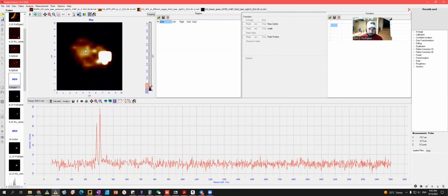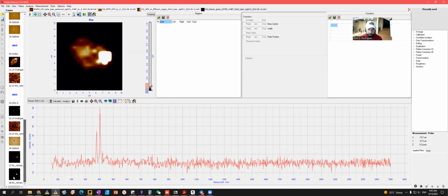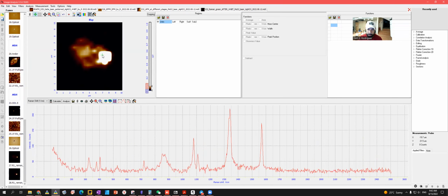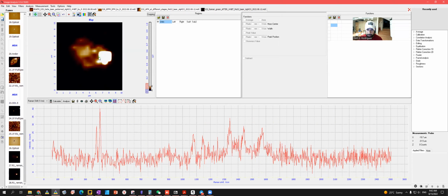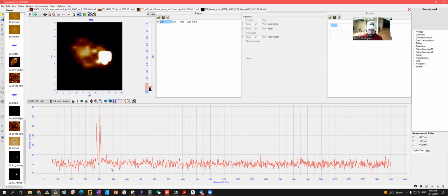So you see from the Raman map, you can see the intensity here. It shows much higher, and that's exactly what this map is telling us. Of course, you have this one also because there is a very strong intensity, and you can see that maybe even these peaks are being enhanced. This peak is being enhanced, or not.